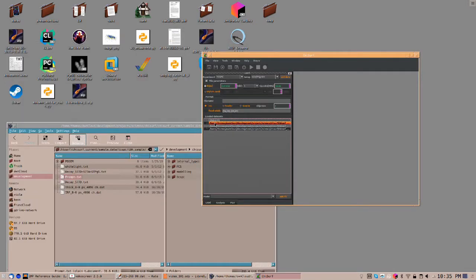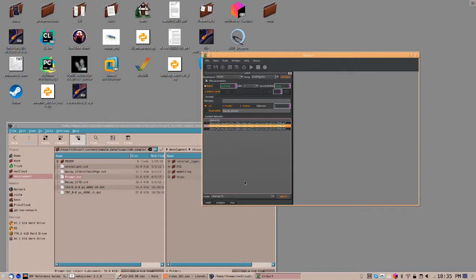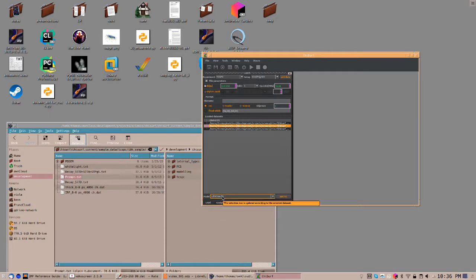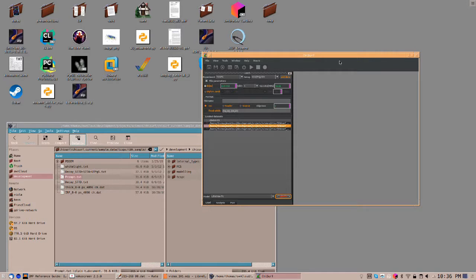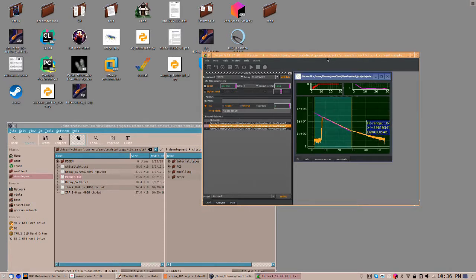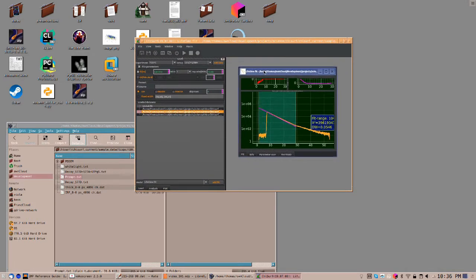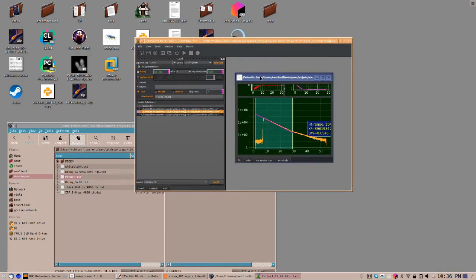Once you've loaded the datasets, select the dataset you want to analyze. Select the model you want to use to analyze the dataset and click on Add Fit. In this case, we use a fluorescence lifetime model, meaning a superposition of exponential decays. Here to the right now, you see your analysis window.